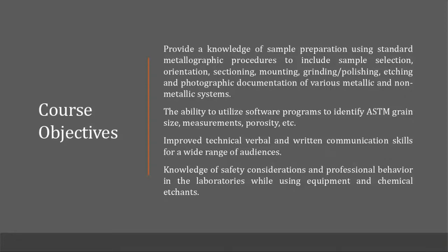As we move forward, just to touch bases, I know that we covered a little bit of this in the lab through our intro session, but I want to be able to provide methodology and knowledge for proper sample preparation using standard metallographic procedures.